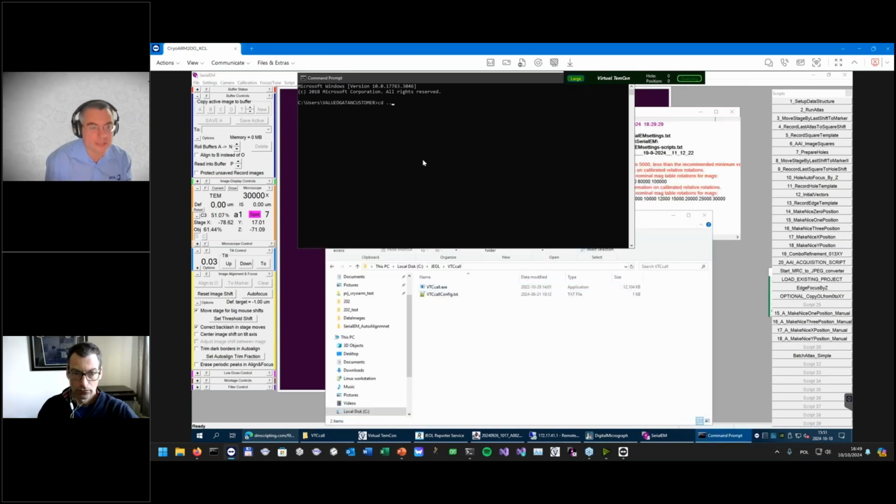So maybe cd JEOL, cd VTC call, and then we can use VTC call, and we can, for example, say report time, if I type it correctly.